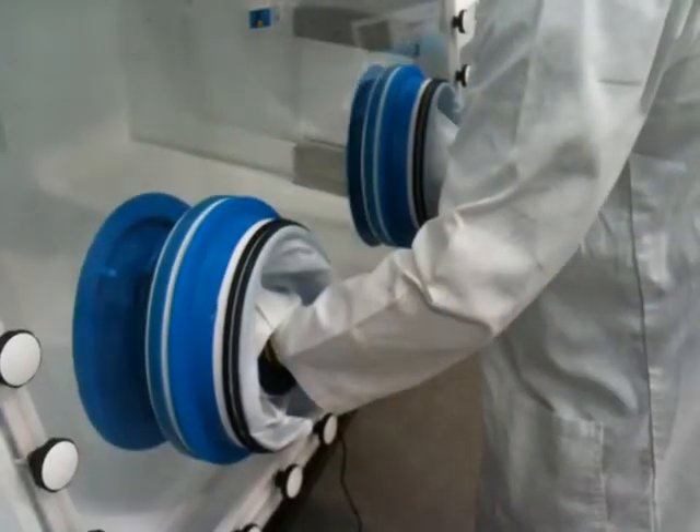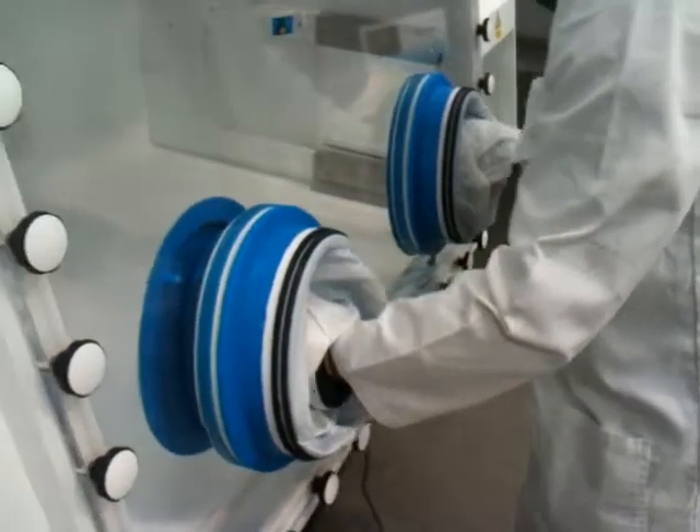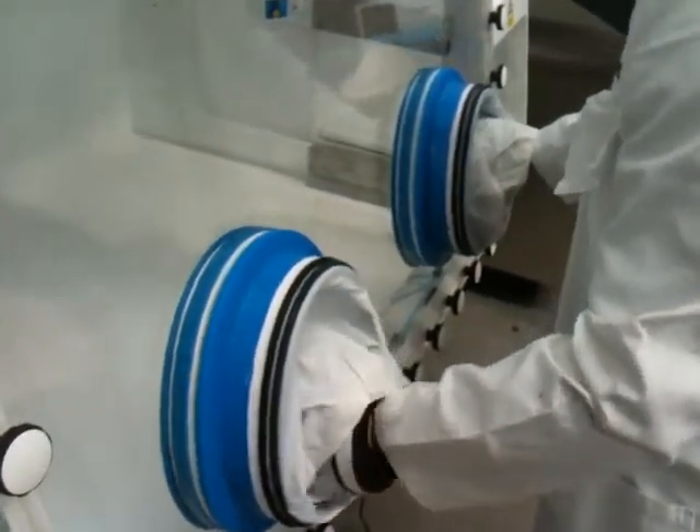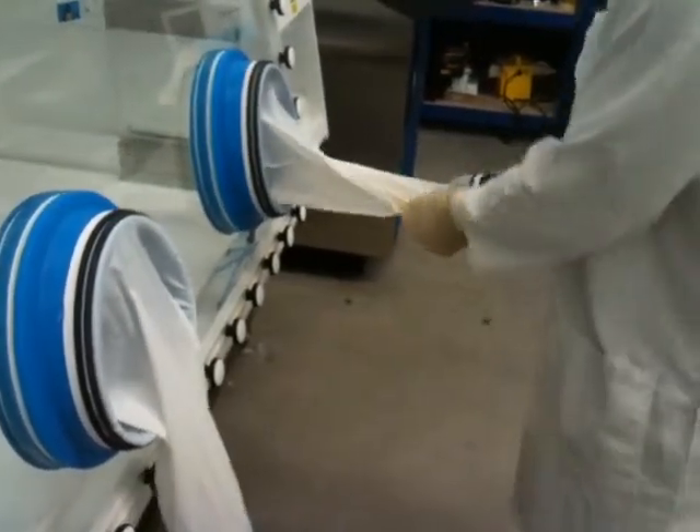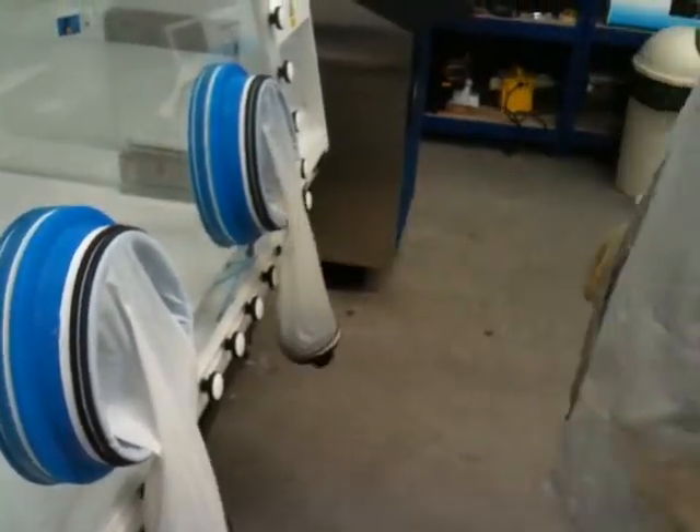Exiting the workstation is even easier. Simply draw the caps back into the port, rotate the handles to lock the caps, and withdraw your hands from the Easy-Sleeves. That's it!